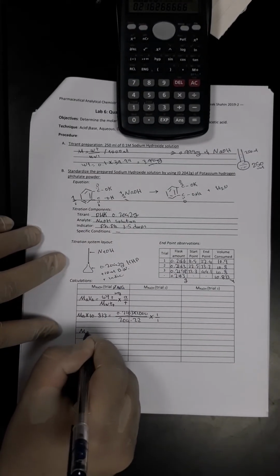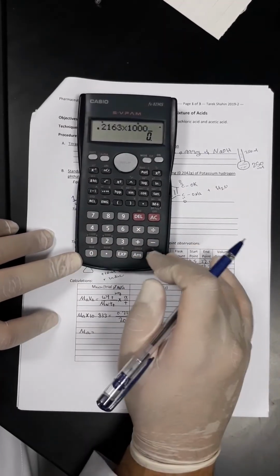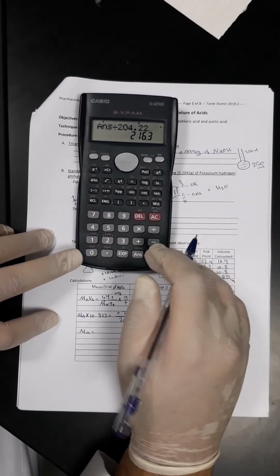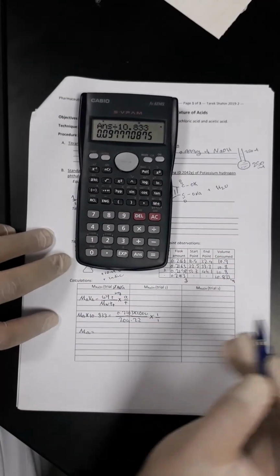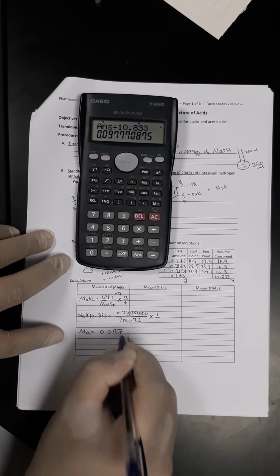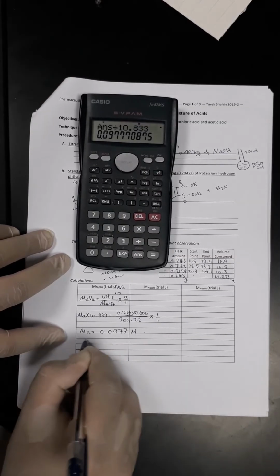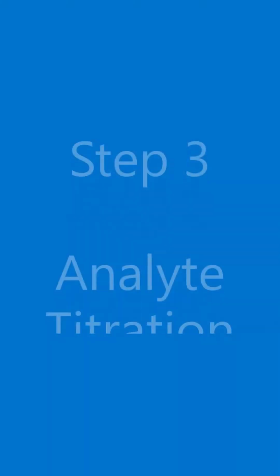So the molarity of analyte will be equal to 0.2163 multiplied by 1000, divided by 204.22, divided by 10.833. So the molarity is equal to 0.0977 molar. This is the molarity of the sodium hydroxide we just prepared.